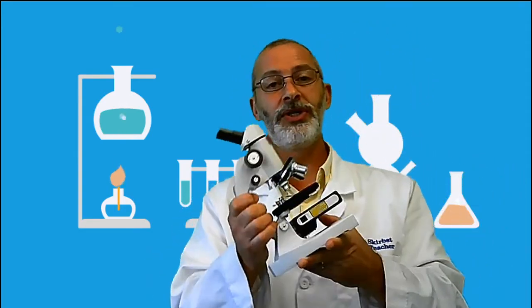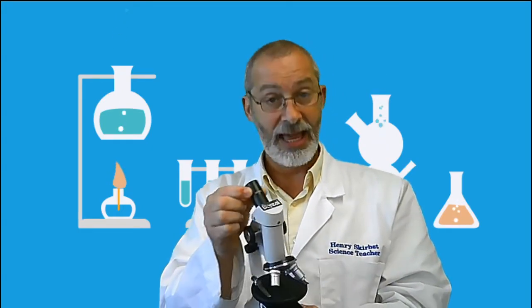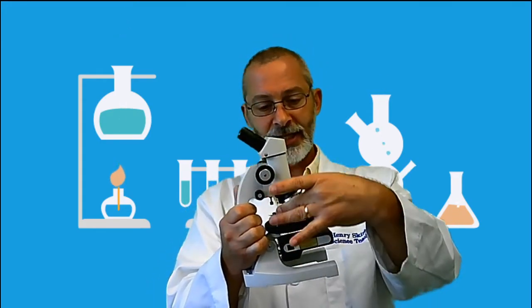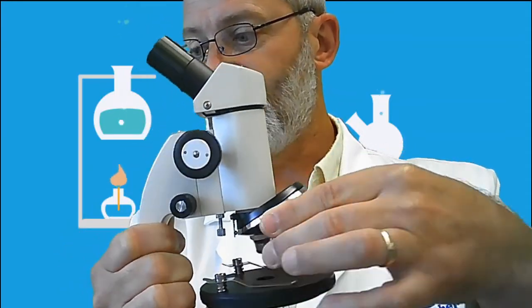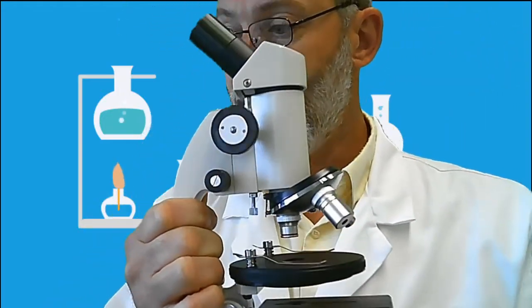All right, so here we have a compound microscope. Here's the eyepiece lens, which is typically a lens that has a magnification power of 10 times, and various objective lenses down below. We're going to be learning not only how to use this compound microscope, but also how to calculate the magnification power using the different lenses that face down toward your specimen. So we're going to spend a lot of time tomorrow learning a lot more about the compound microscope. But hey, let's get back to our notes now.